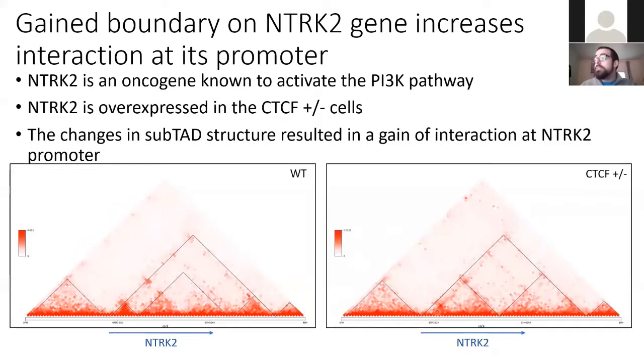So these smears are a representation of this enhancer scanning and of the dynamic regulation and upregulation of this gene in the knockout, allowed by the loss of insulation here.